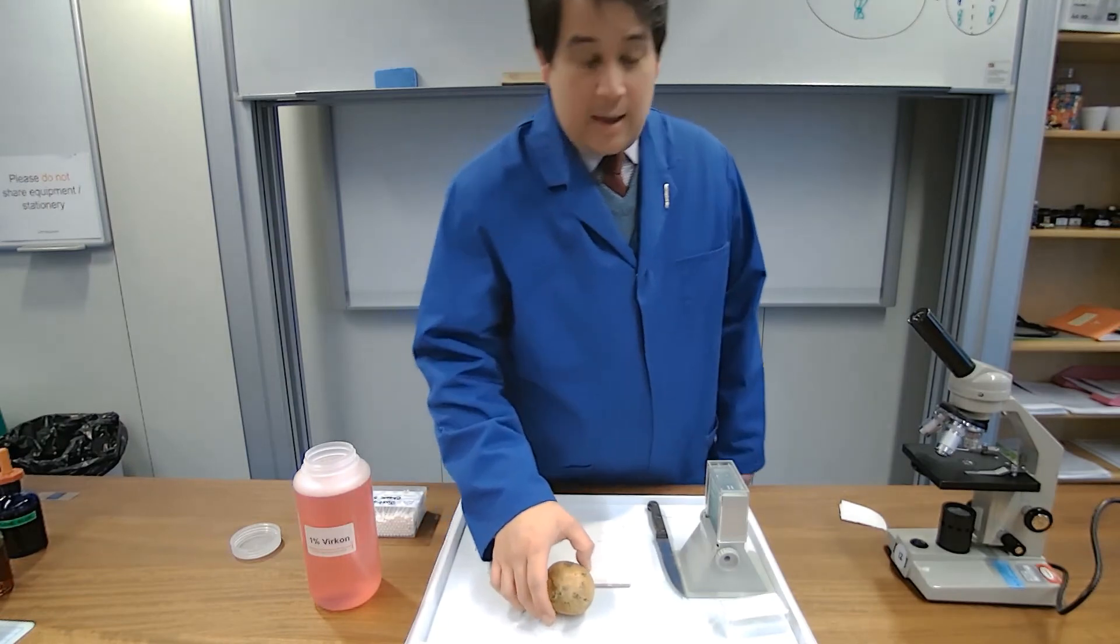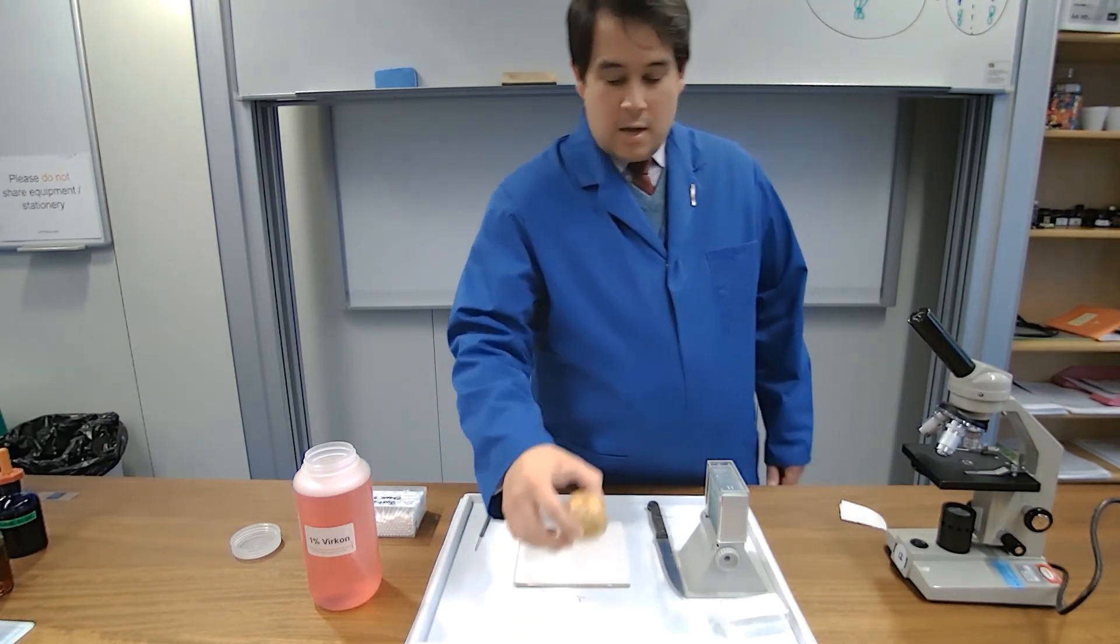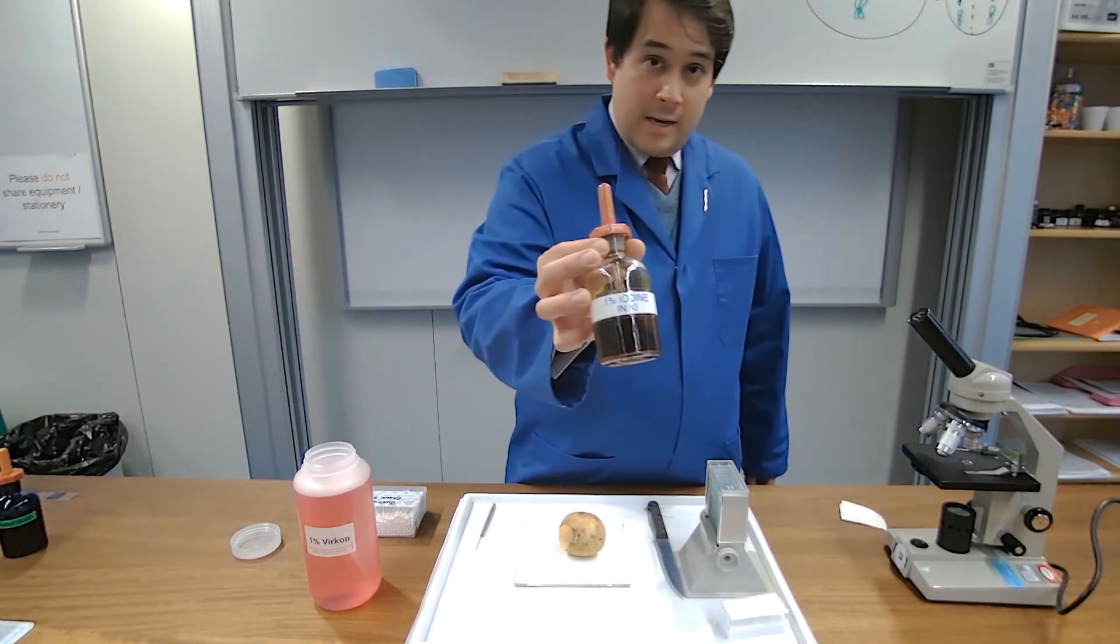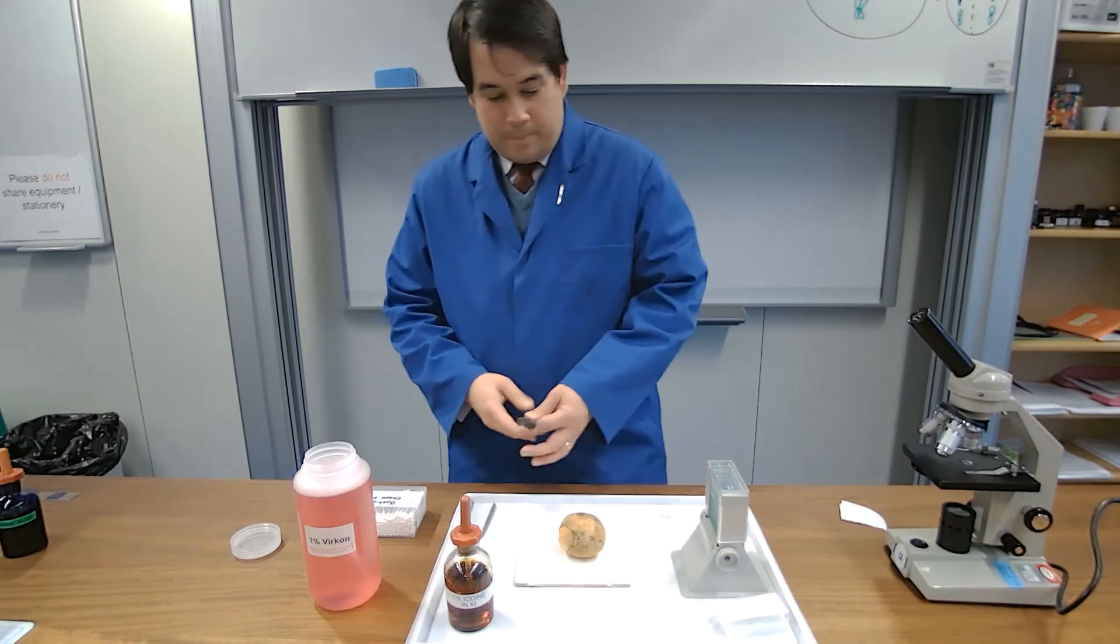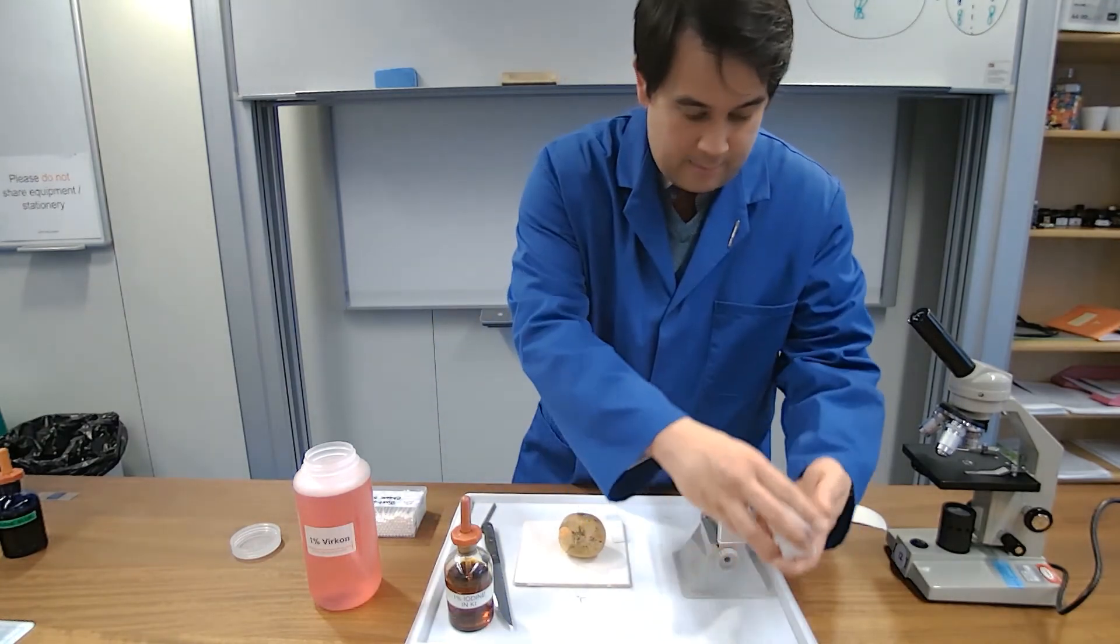Next we're looking at a plant cell slide preparation. So we're going to look at onion which is our plant. We're then going to use a different stain this time. We're going to be using iodine.